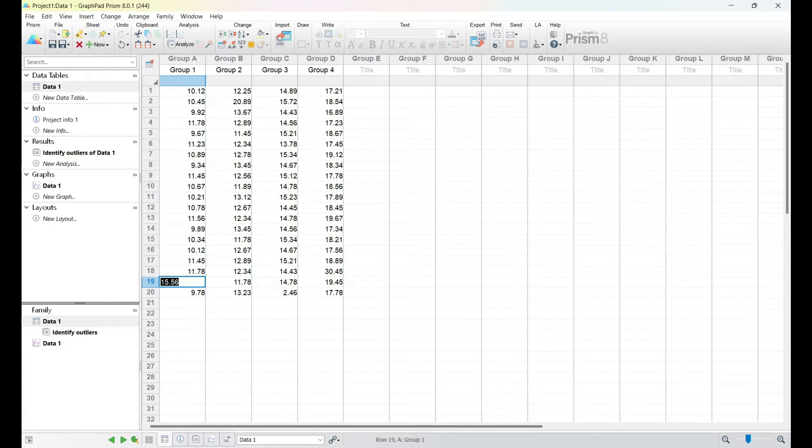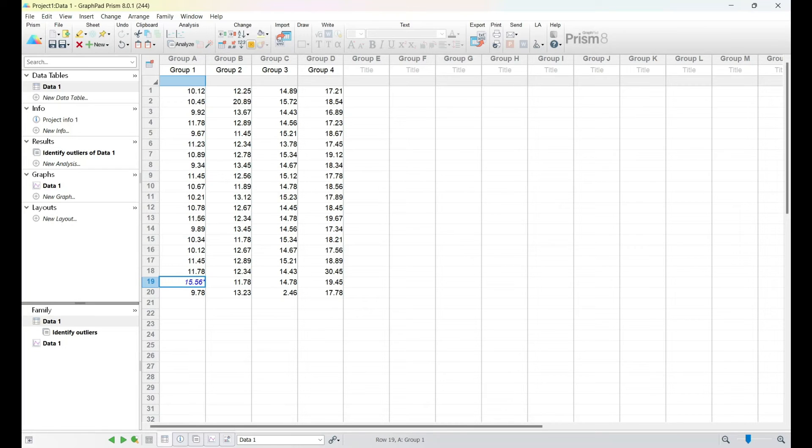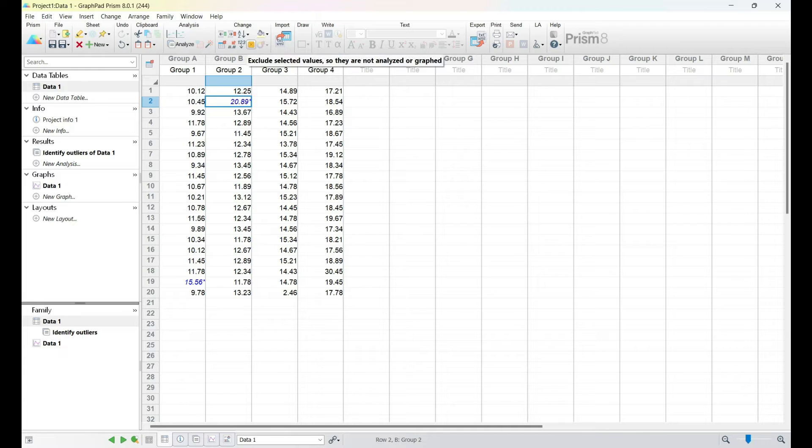By the end of this section, you'll feel confident in handling outliers in your data, setting the stage for a more robust statistical analysis.